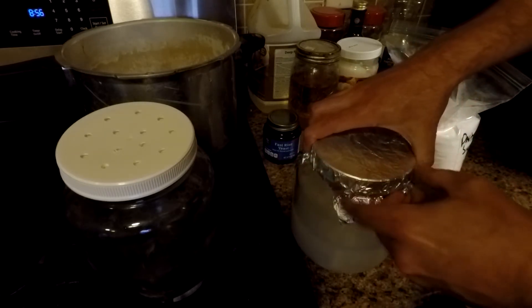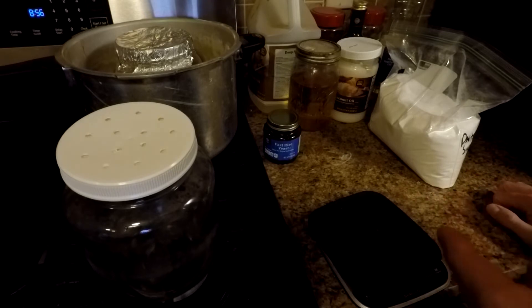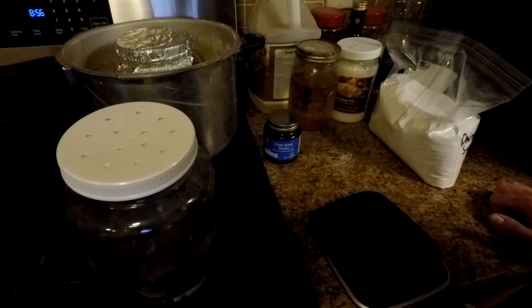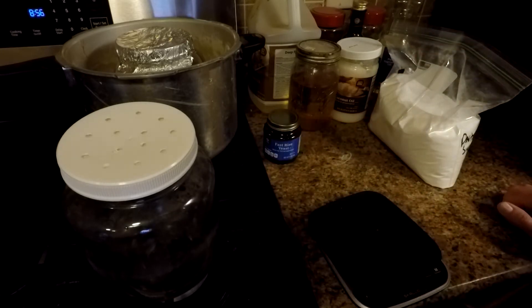The culture I got from Sporeworks is most likely a multi-spore culture. With oyster mushrooms, there's such a small difference in yield between an isolated culture and a multi-spore inoculation — I'd say multi-spore is going to be just as good. The only advantage I've seen to isolated strains with oysters is that you can get different cap shapes. I've gotten some blue oysters before with more of an umbo, like an umbrella shape, which was cool, but they tasted the same and yielded the same as multi-spore.